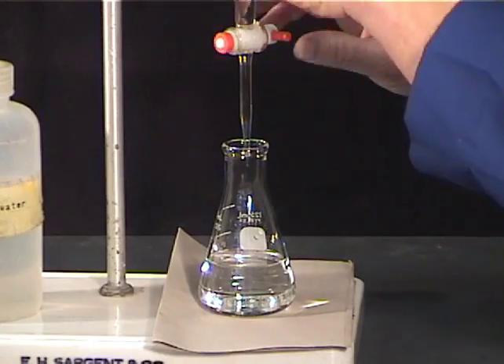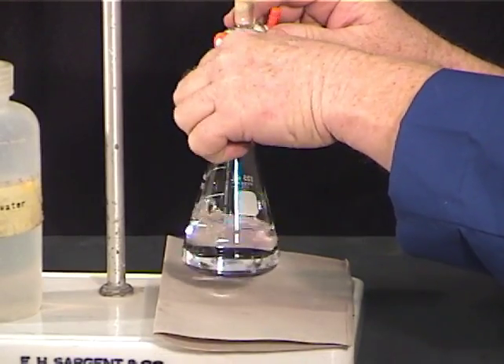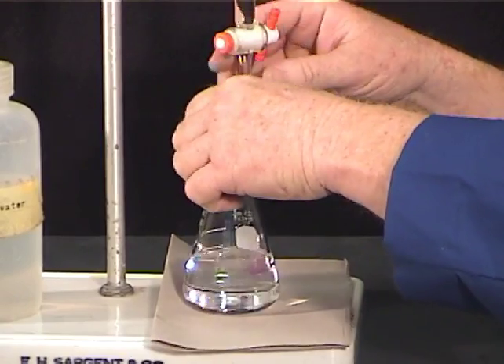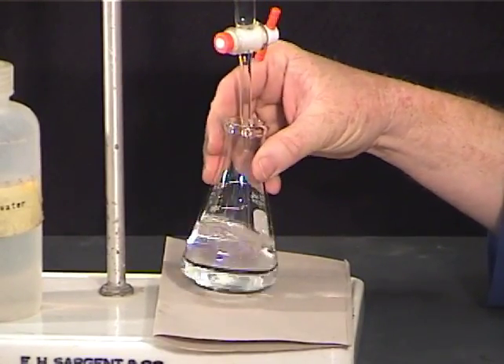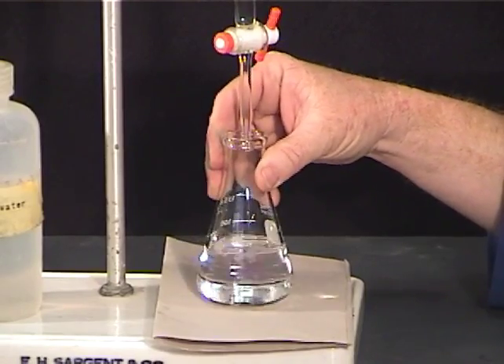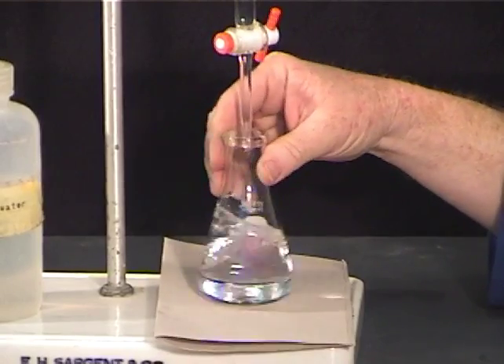Now you are ready to begin the titration. Initially, you may add the titrant rapidly while swirling the Erlenmeyer flask. The indicator will begin to change color in regions of high titrant concentration, but with swirling the color will disappear before the equivalence point is reached.